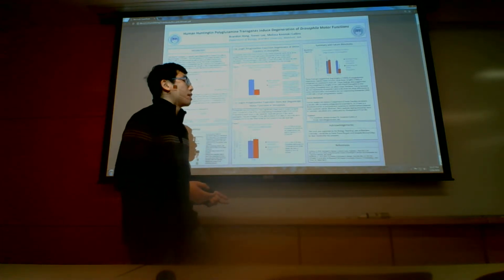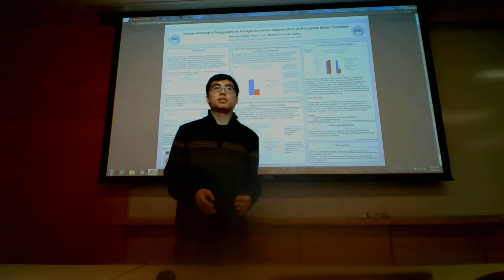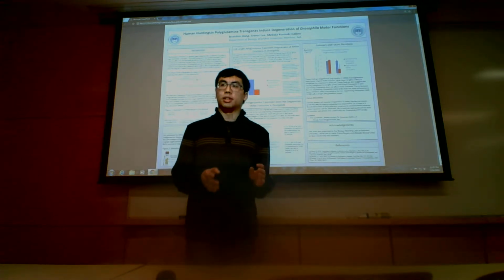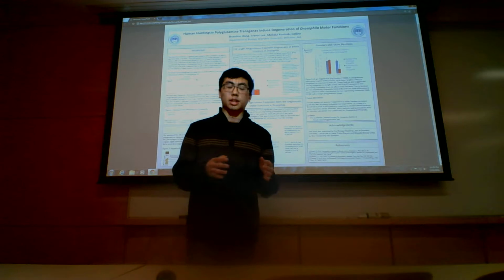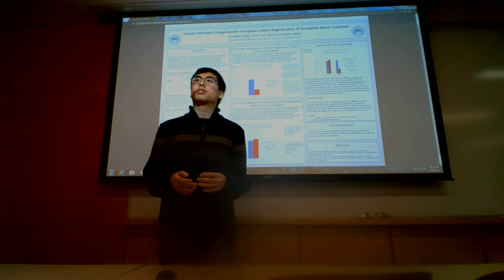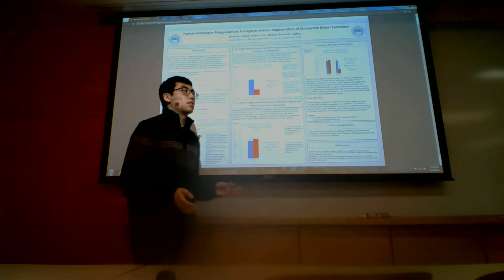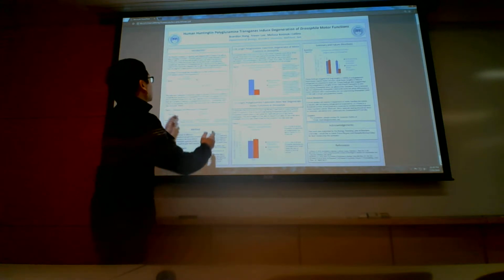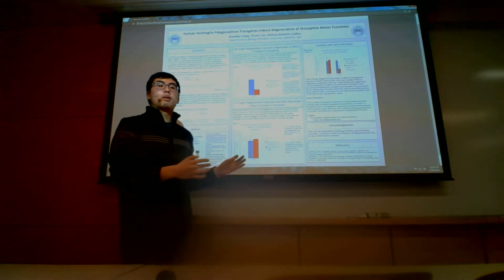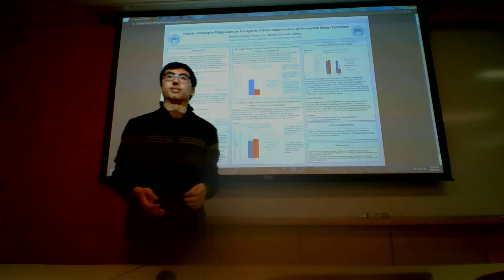Now, previous studies have shown that when you increase the length of polyglutamine repeats, there is a change in Drosophila behavior. However, the link between the length of polyglutamine repeat you express and the degree of deterioration in the motor functions of the Drosophila has yet to be seen. So what we did was use human HTT DNA and put it into Drosophila. We made a transgenic organism.